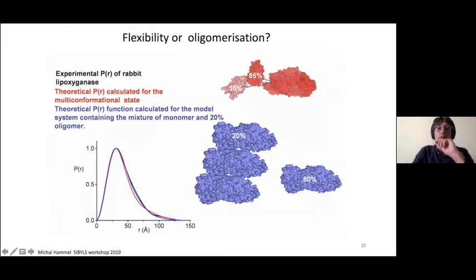And when you expect some movement in the secondary domain, and you model these scattering profiles from these extended conformers, that's the red curve. They are very similar to each other, and they are similar to the black curve. And the black curve is indeed your experimental data.